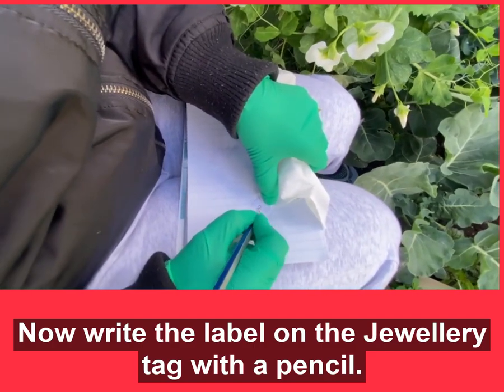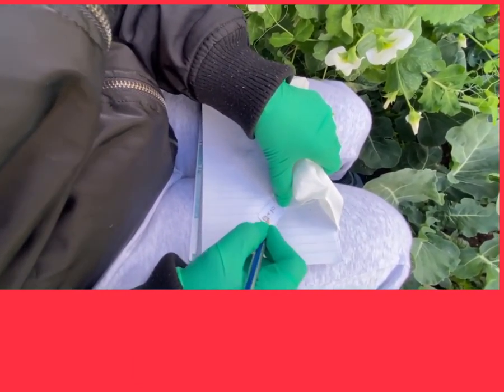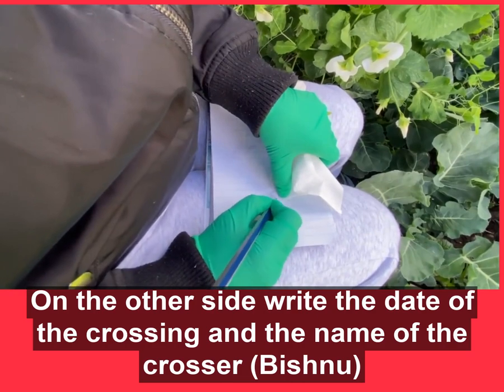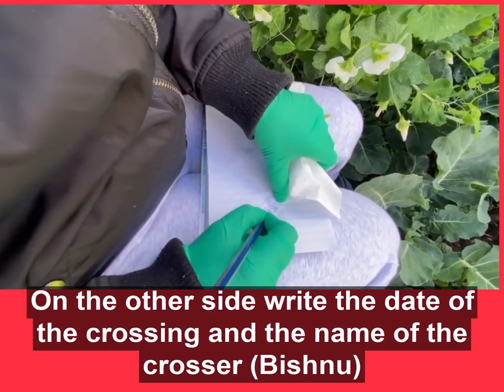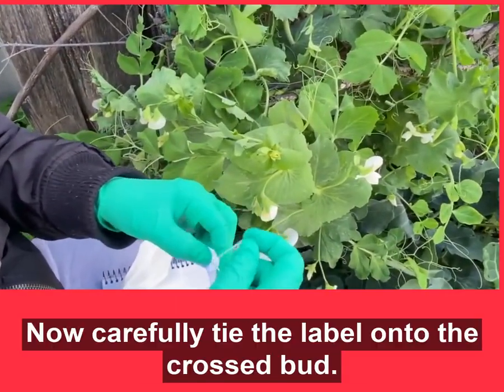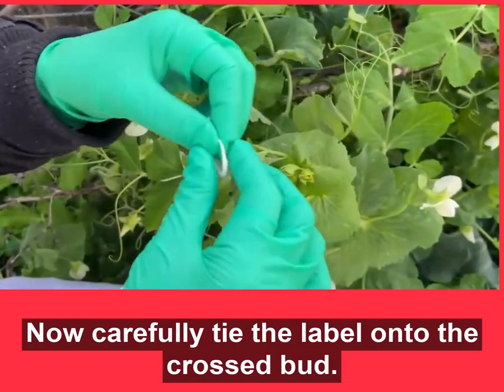Write a label with the female on the top and male on the bottom on one side, and on the other side put your name and date of the cross. Now carefully tie the tag onto the crossed bud.